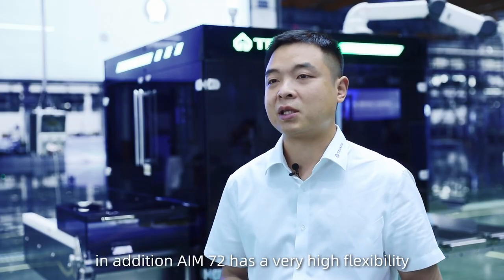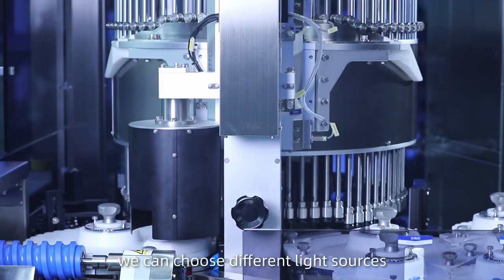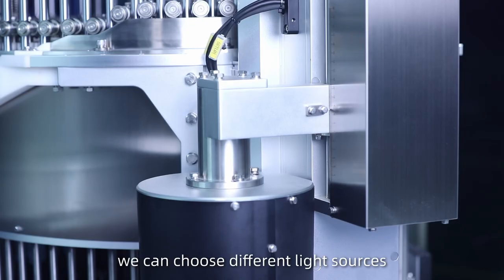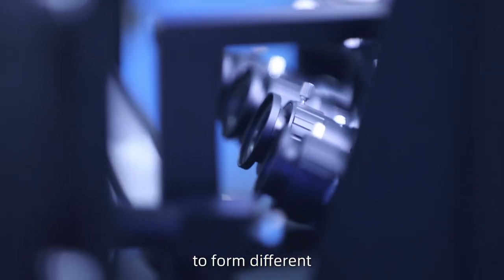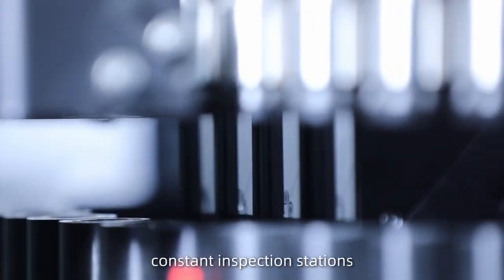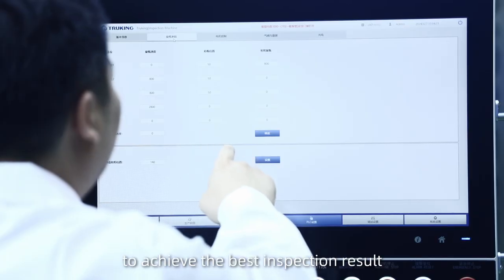In addition, AIM 72 has a very high flexibility. We can choose different light sources, cameras and industrial computer configurations to form different custom inspection stations according to customers' needs to achieve the best inspection result.